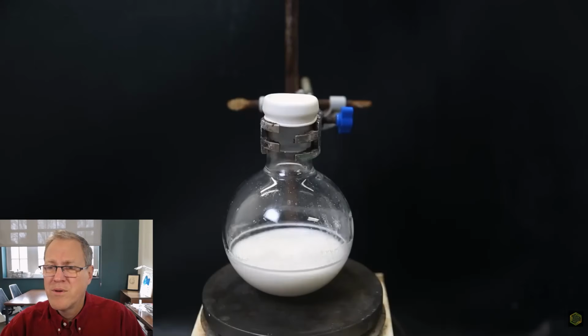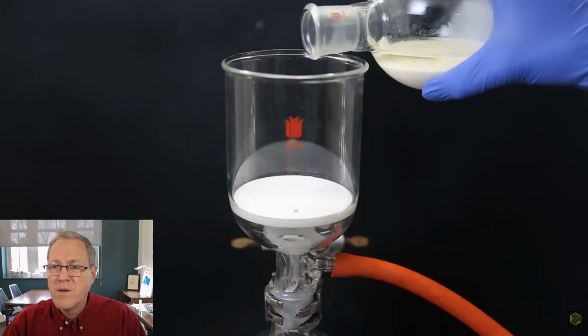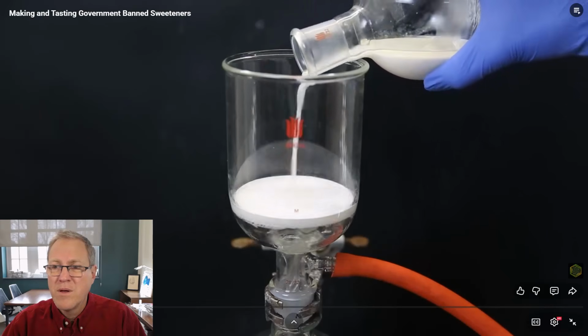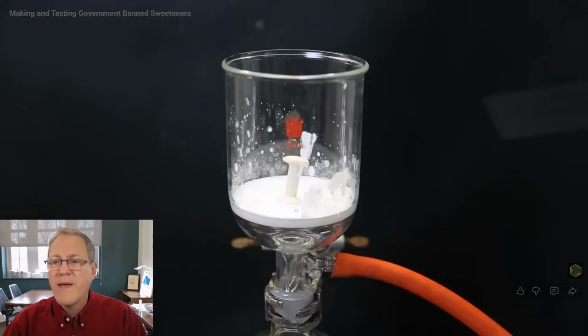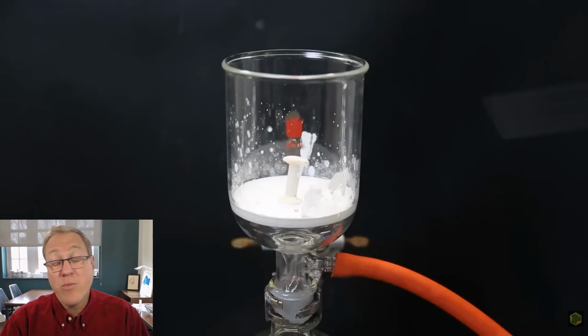After 2 hours, more precipitate has formed, and the reaction should be finished. When left to stand, we see the white product settle to the bottom. So to collect it, I set it up for vacuum filtration through a glass frit with a filter paper on top. Now, I will say, he likes using this glass frit, and I'm assuming it's the same one. It may not be the same one. And when I look at other chemistry content creators on YouTube, they also like glass frits.